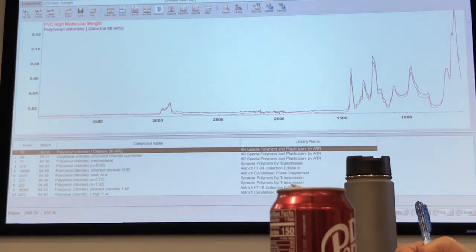That's the big deal. The answer to your question is that reflectance depends on particle size and the shape of the particle. So in order to do a good reflective measurement, you generally have to rotate the sample, so that you have a bunch of measurements that average to give a better spectrum like this. When you're doing microscopy, you cannot rotate the sample. That's one of the reasons. If you look at anything with your eyes and change the angle with regular light, you see differences in shape, sometimes even differences in color. The same thing is happening.